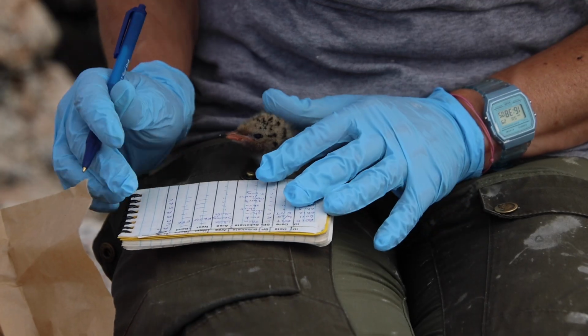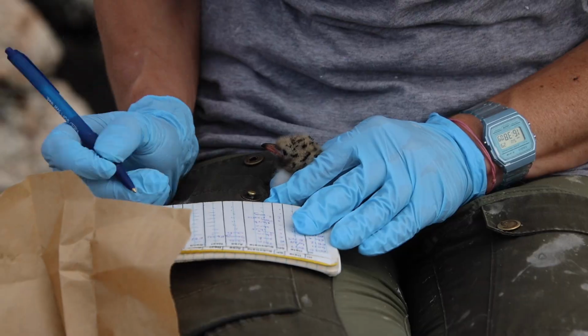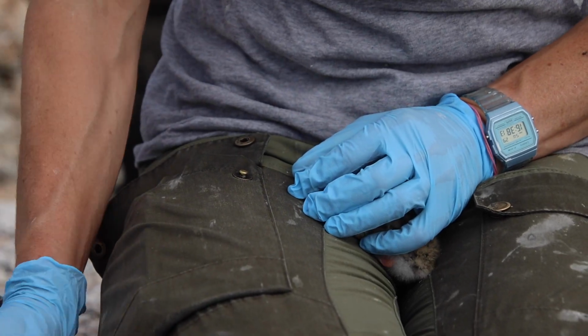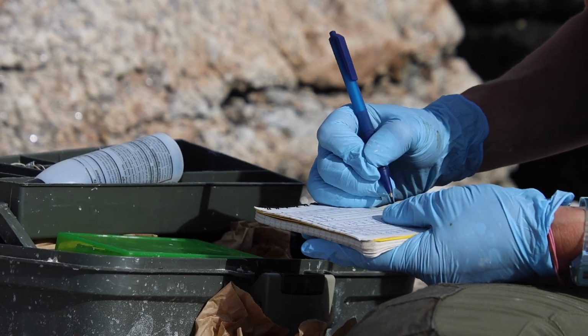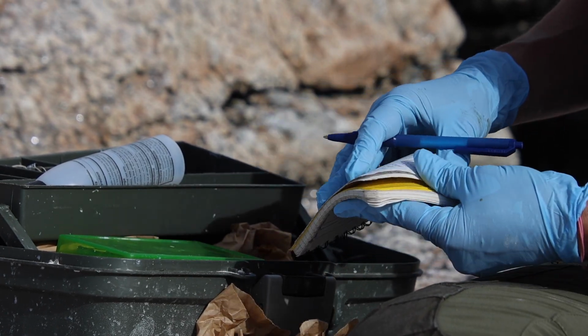For recording metadata, we obviously want to know what species it came from, when and where, and what substrate the sample came from. Was it from a paper bag, from plastic, or from clean clothing? Obviously not my clothes here, they're very dirty. It's also a good idea to record the age of the chicks so that we can look for variation in diet with chick age.